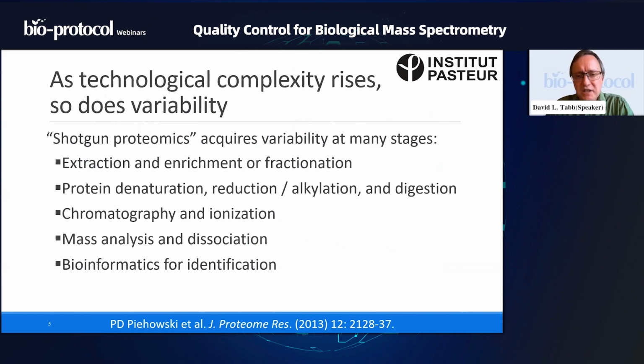All right, now the principle at the top is true for anything in biotechnology. And here I'm going to try to unwrap that statement in the bullet points below in the context of shotgun proteomics. But at the moment, I just want you to internalize that the more complex a process is, the more doors there are for variability to enter the experiment.